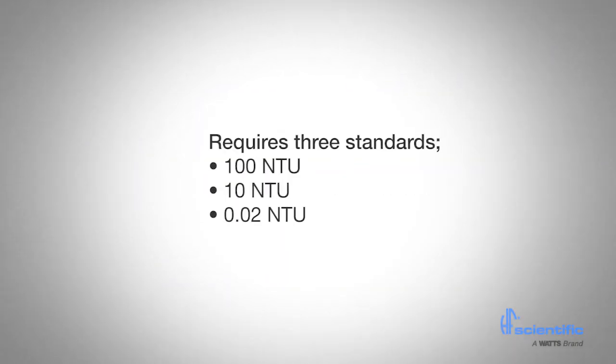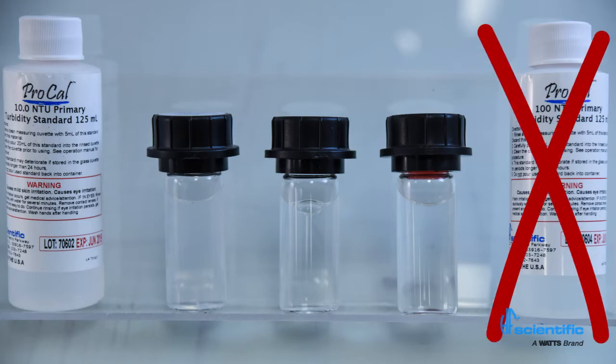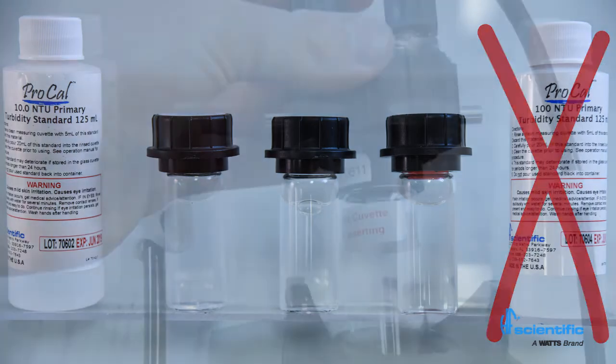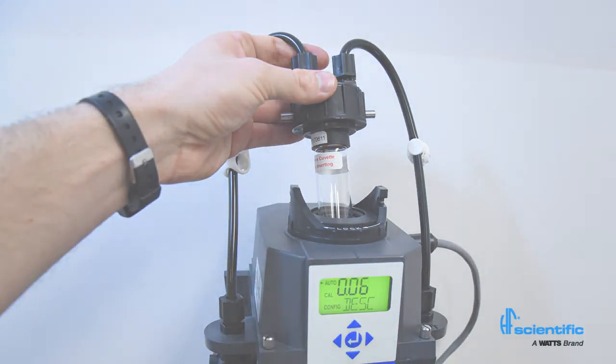A full calibration requires 3 standards: 100 NTU, 10 NTU, and 0.02 NTU. The MTOL Plus offers quick calibration that requires approximately 25mL of the standard solution and 2 minutes to complete. If readings above 10 NTU are not required, the step for 100 NTU can be omitted. In this case, the last valid 100 NTU calibration value will be used for any readings above 10 NTU.